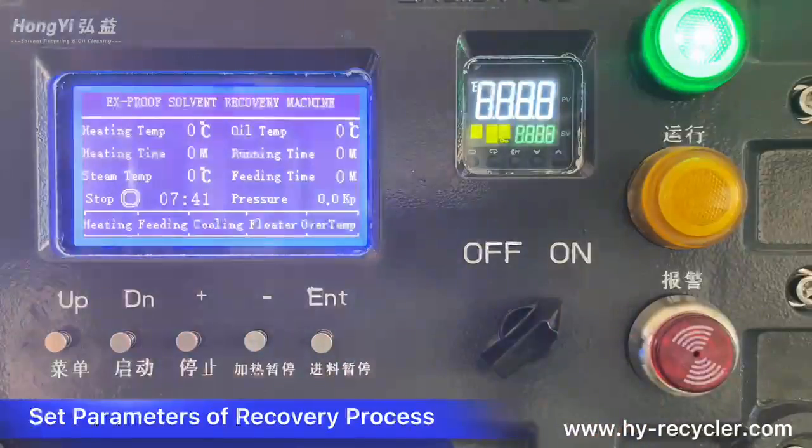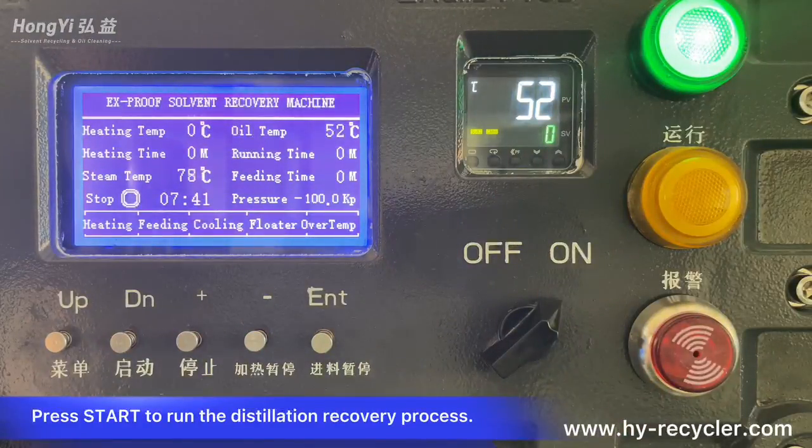Set the parameters of the recovery process, then press start to run the distillation recovery process.